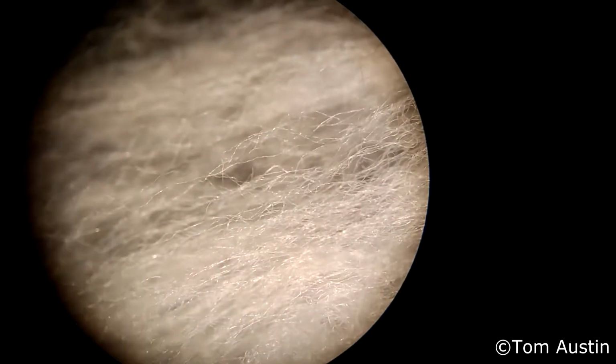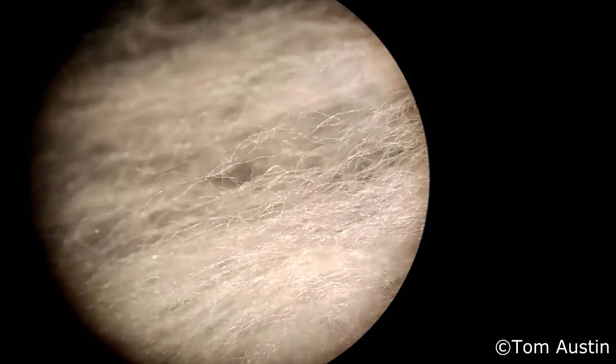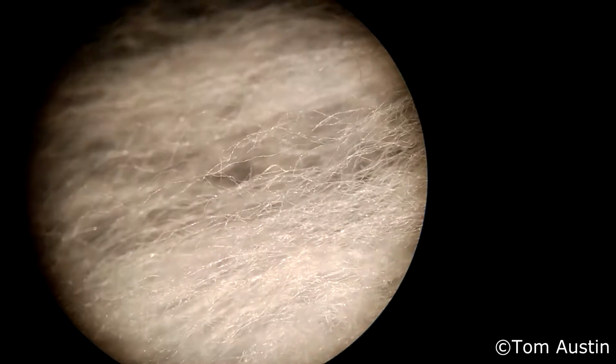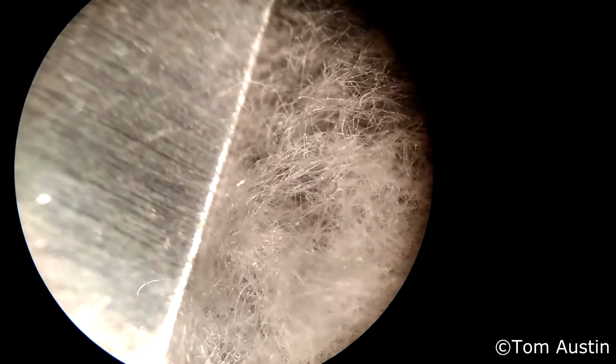Also note that they're not pure white. They're a little bit creamy and translucent. It's also a good thing to see. And by the way, all of this footage so far has been at 2x magnification. Here's some more of the same.